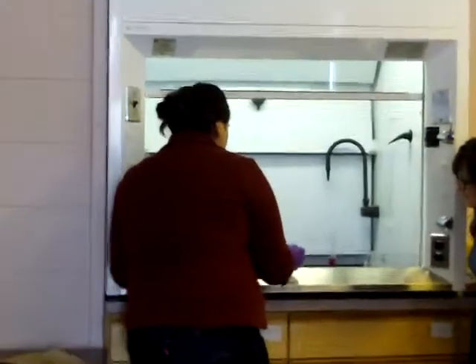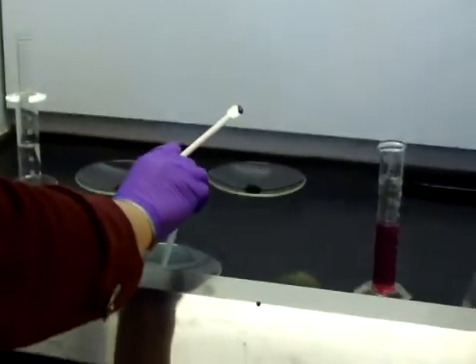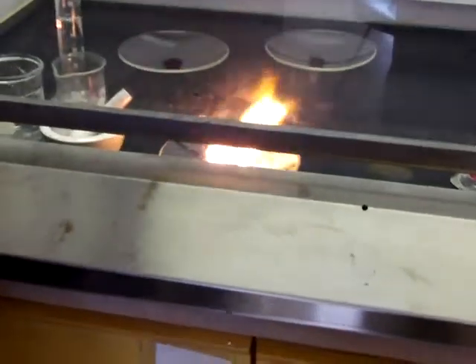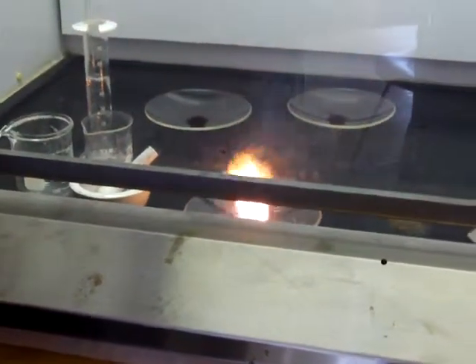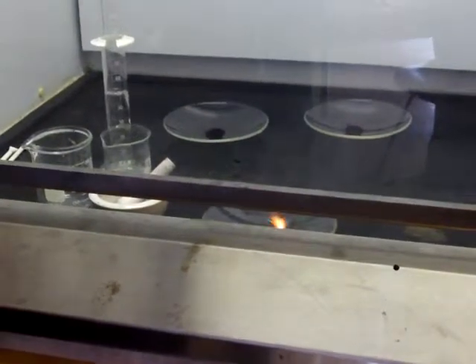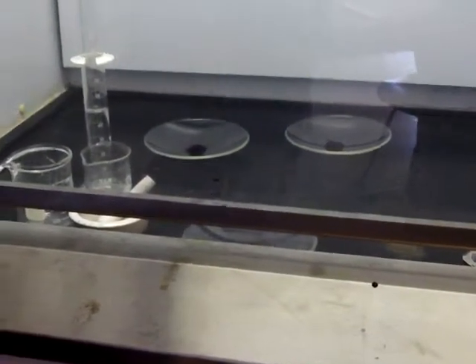You kind of stay it up by pushing it down. I hope it works. This one doesn't work all the time. Okay, add some more. Okay, so that's potassium permanganate and glycerin.